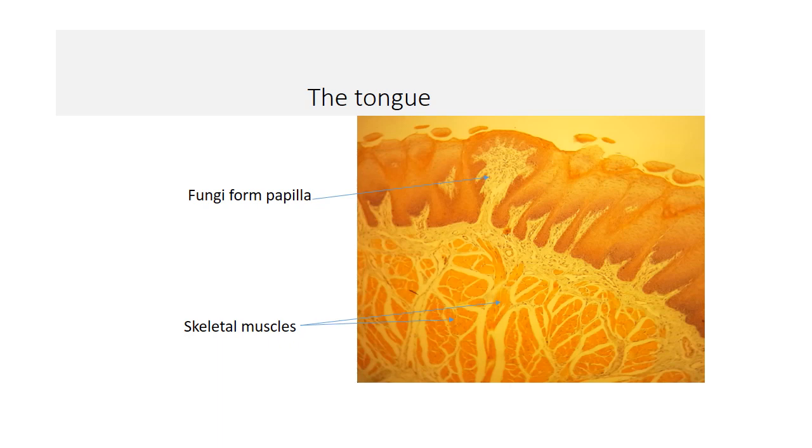Here, another section shows the fungiform papillae. Here, the fungiform papilla with a broad, non-keratinized surface, and the core composed of lamina propria.